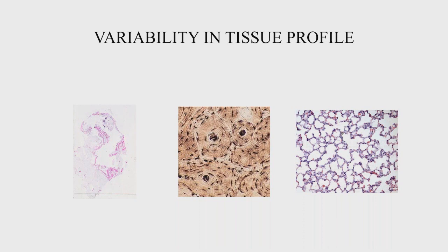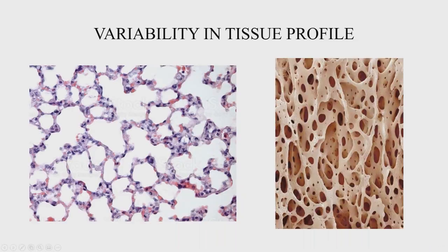The picture on the right is actually lung tissue, and sometimes there are calcifications in lung tissue for whatever reason or pathology. But you see how delicate these alveoli sacs are, and say you have some mild calcification in there. Well, you certainly can't use a very aggressive decalcifier for this because it will destroy these thin alveoli membranes. And if you use something too soft, then you'll shred the tissue as you attempt microtomy because there are still calcifications in that. So all of this thought really has to go into breaking down this matrix that I talked about. But basically, it's all the same concept, where you have bone cells that are secreting this cement-like matrix.